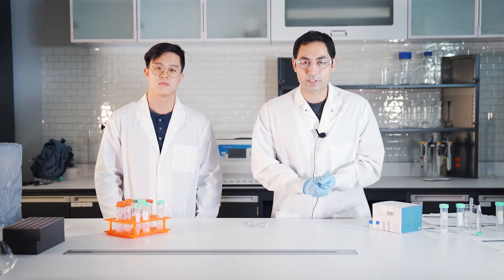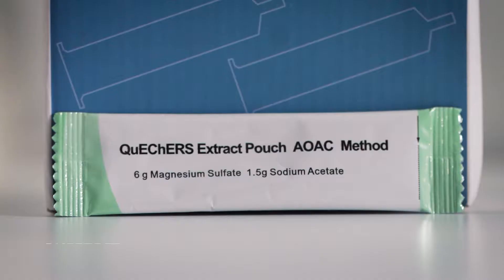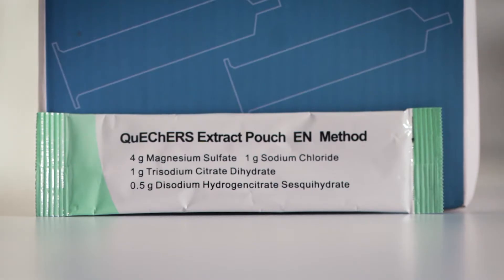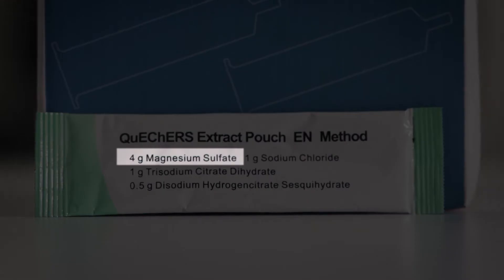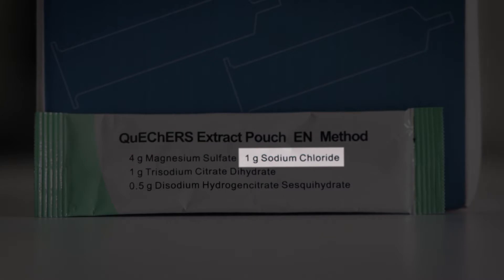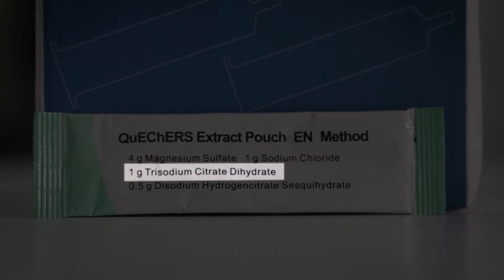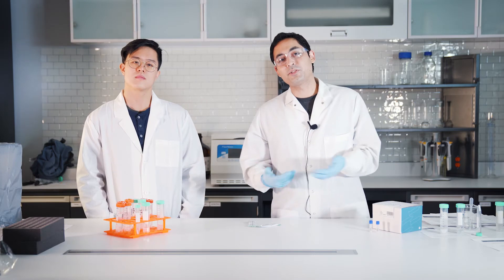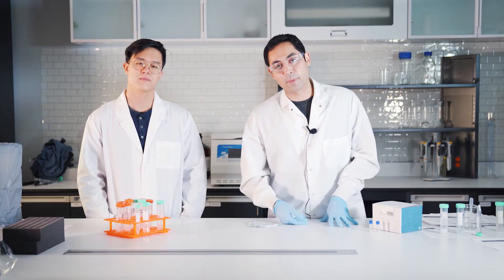For the EN method, that's the European method, it's 4 grams of magnesium sulfate, 1 gram of sodium chloride, 1 gram of trisodium citrate dihydrate, and half a gram of disodium hydrogen citrate sesquihydrate. Why would you choose one over the other? It's basically dependent on the recovery that you would get.